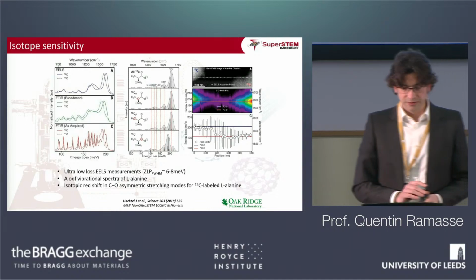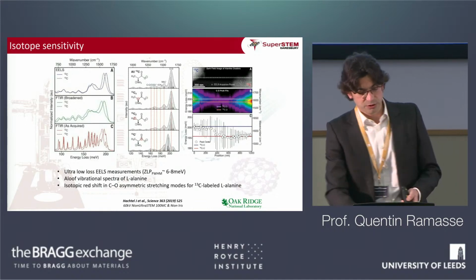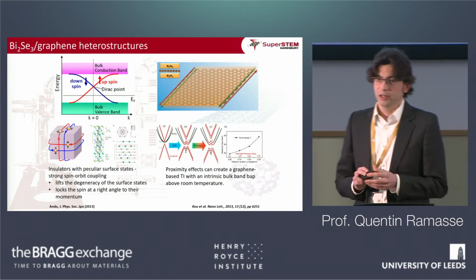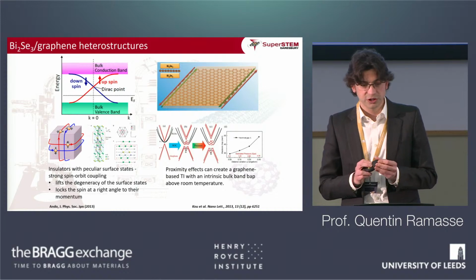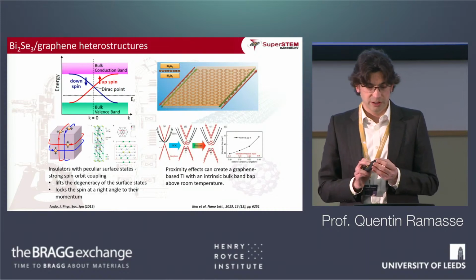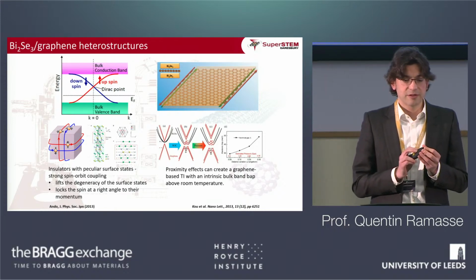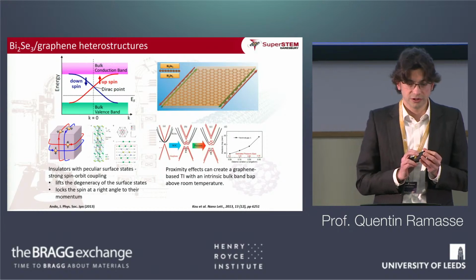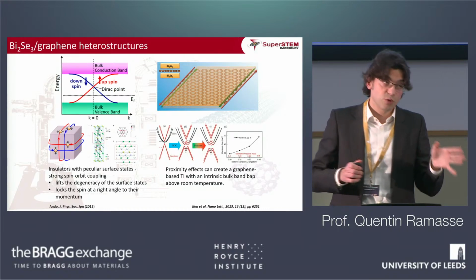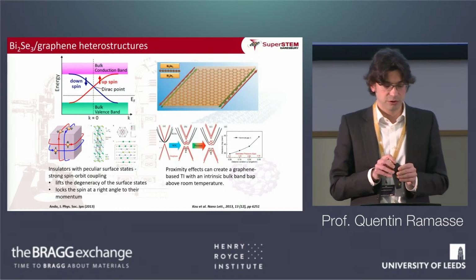Just because I've talked about single atoms, nanoparticles, nanoscale materials, I want to go back to looking at very pretty images and very pretty atomic structures, and the application that I want to use as an illustration for this is graphene heterostructures grown on silicon carbide, just to show you that you can put all of this together, even for somewhat bulk materials, and that's a really exciting field for microscopy going forward.